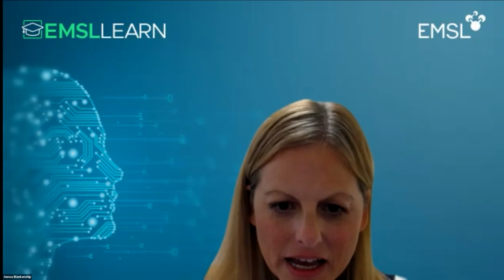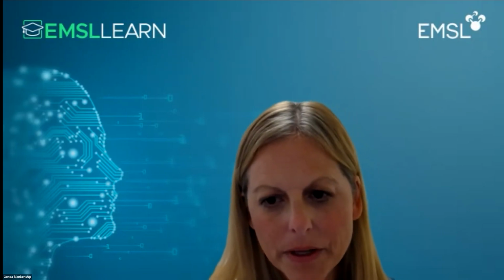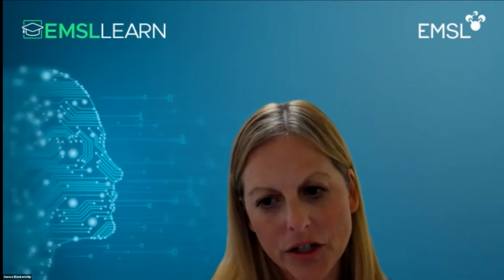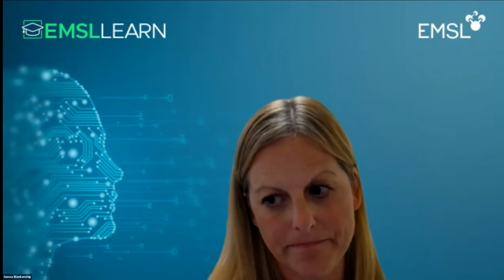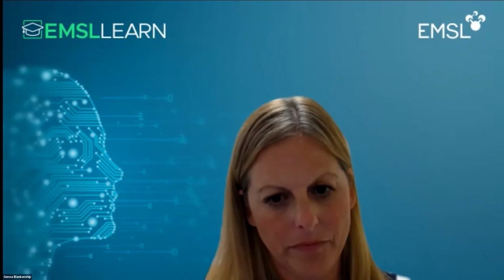Okay. Question from Rebecca. Can you upload data that is already log2 normalized and/or with samples relative to each other? So yes, you can upload data that's already been log2 transformed and/or normalized in addition to that transformation. There's a way you can indicate that when you do that data upload.